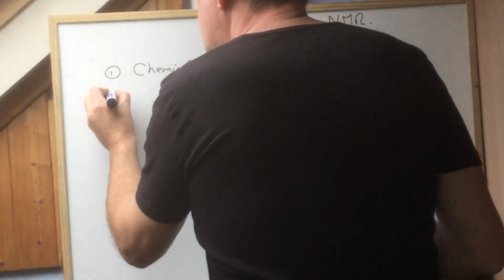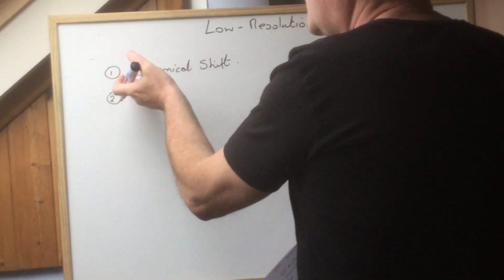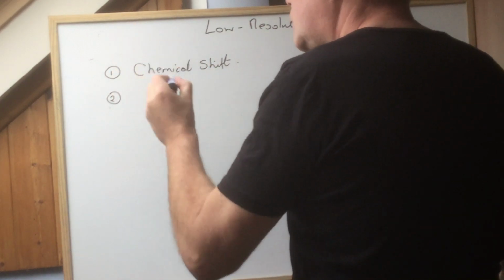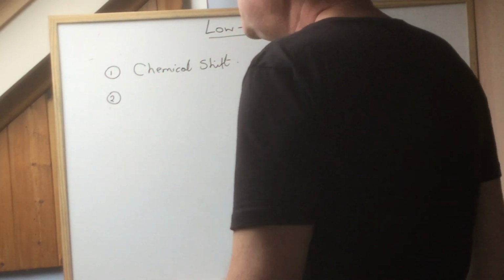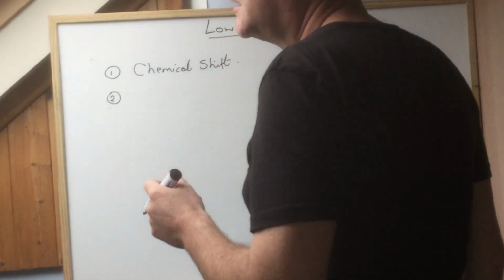So low res tells you the environments of the protons. So that's one thing it does, even though it's low res. That's exactly the same as carbon-13.